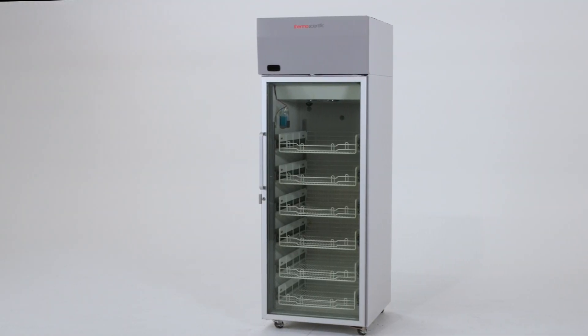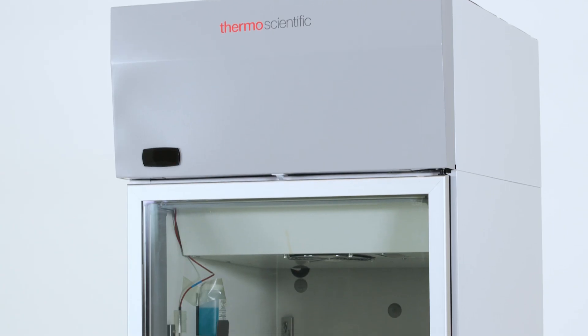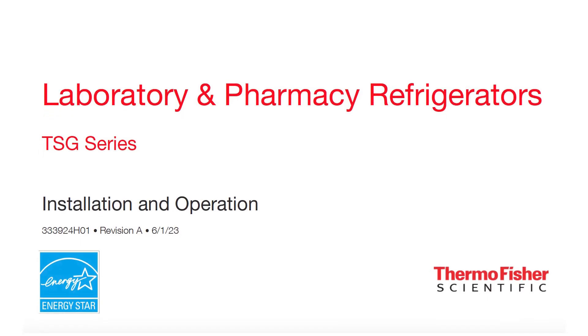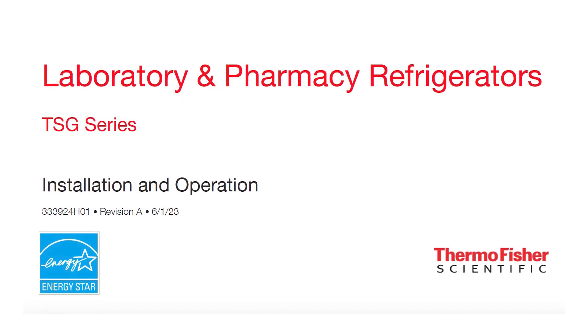Learn how to inspect and unbox your new Thermo Scientific TSG laboratory refrigerator. For full instructions, refer to your TSG series installation and operation manual.